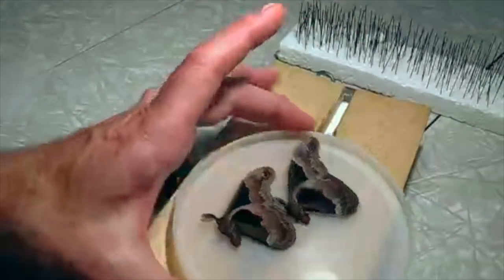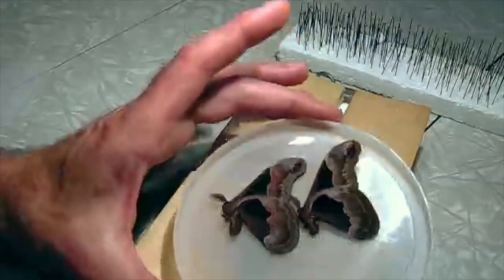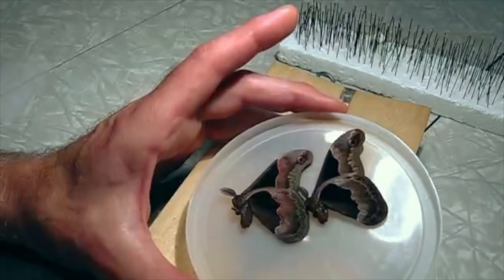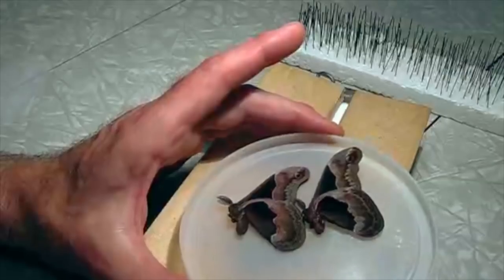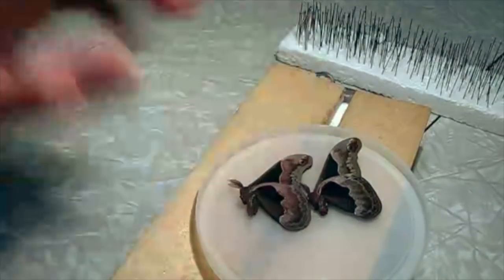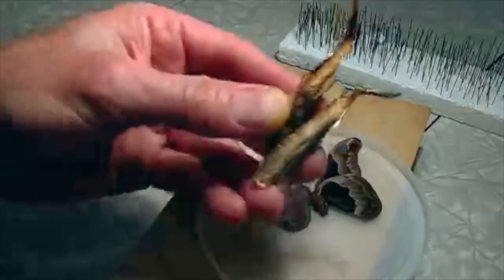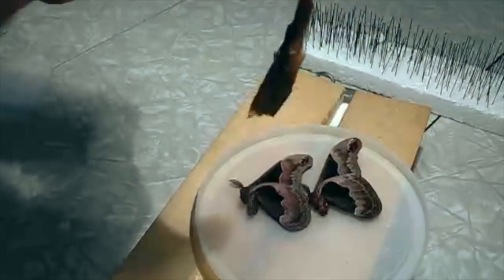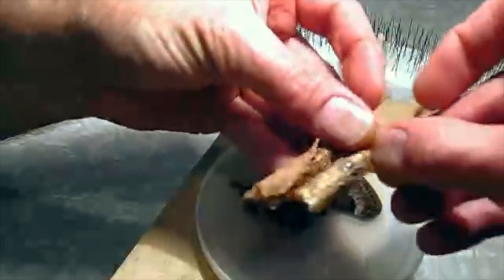Today I have a couple of moths. These are Saturnian moths from the Eastern United States — Callosamia promethea. These are both males. I got some cocoons last fall. Here are the cocoons. They're very distinctive looking; they hang from a branch like this. And these are captive raised.